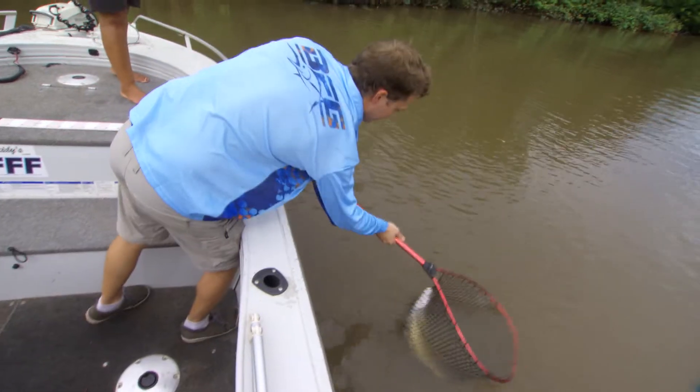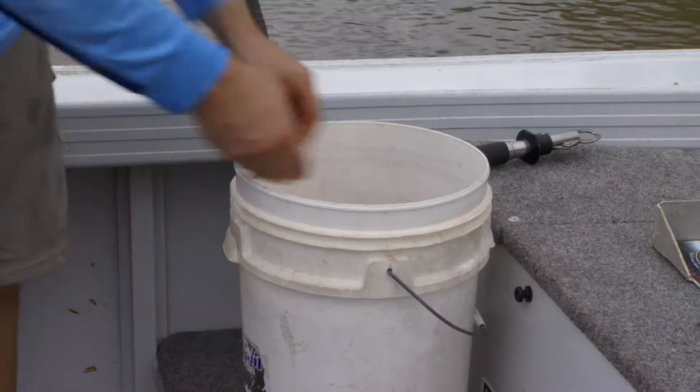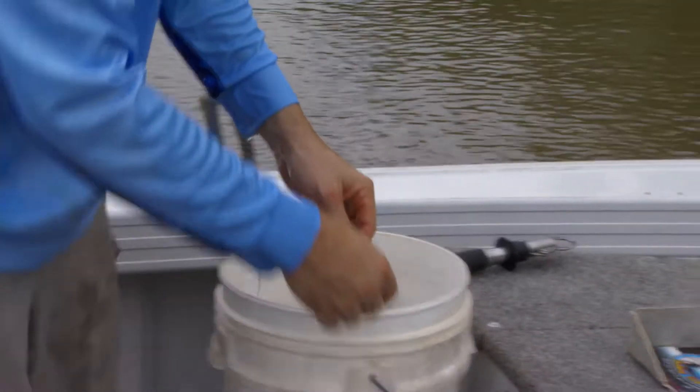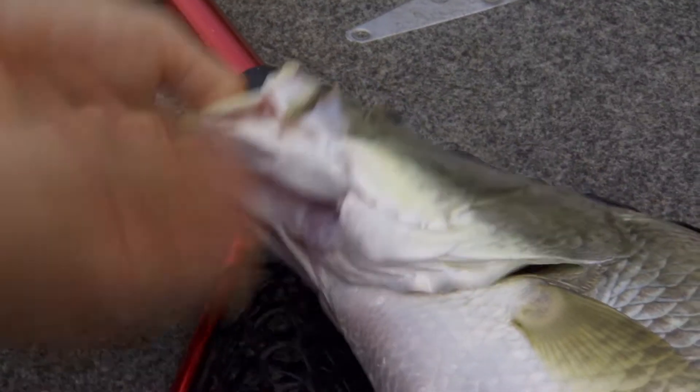Once a fish is caught it is important to work quickly. First net the fish and bring it to your work area. Wet your hands and handle the fish as little as possible, attempting not to remove too much of the slime layer that protects the fish from bacterial infections.